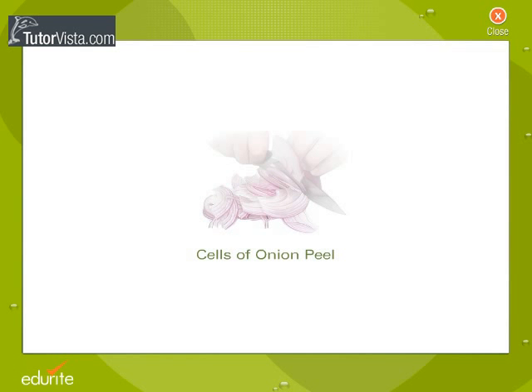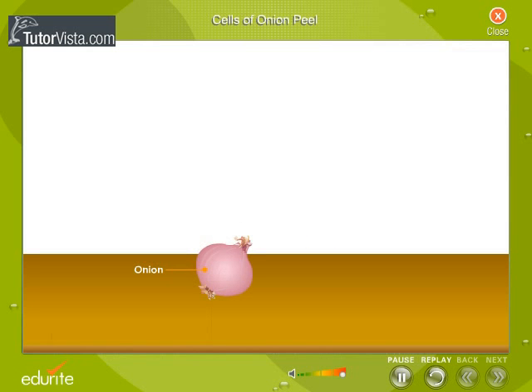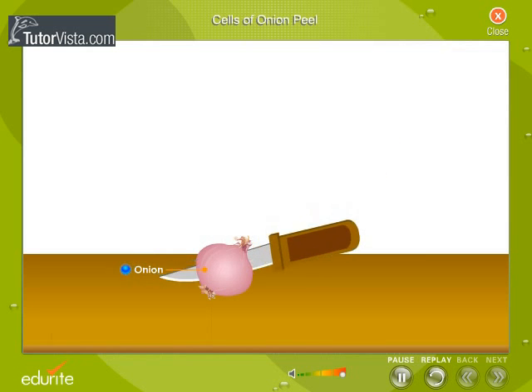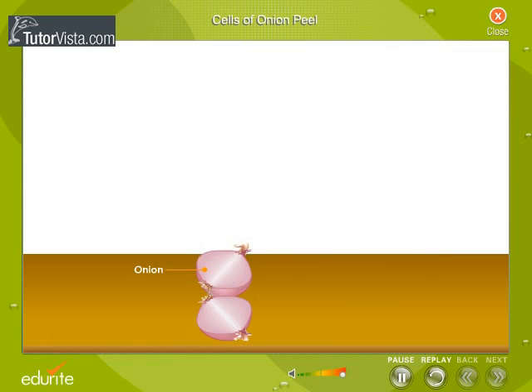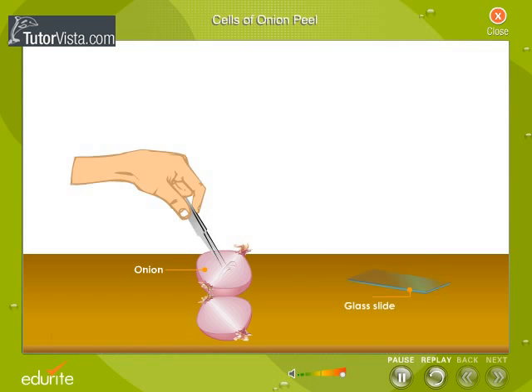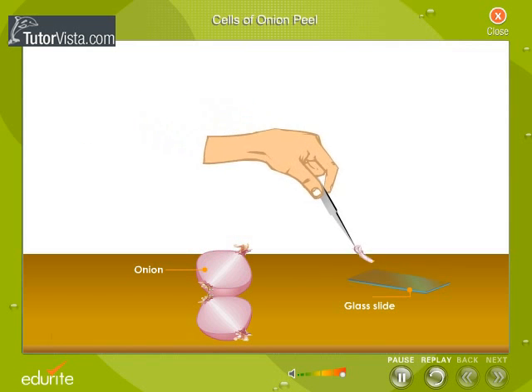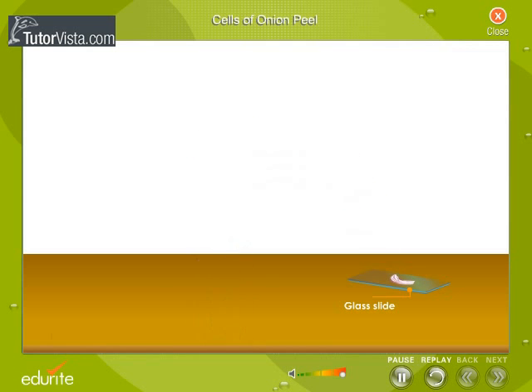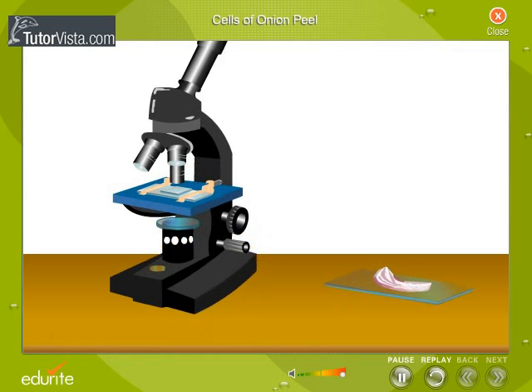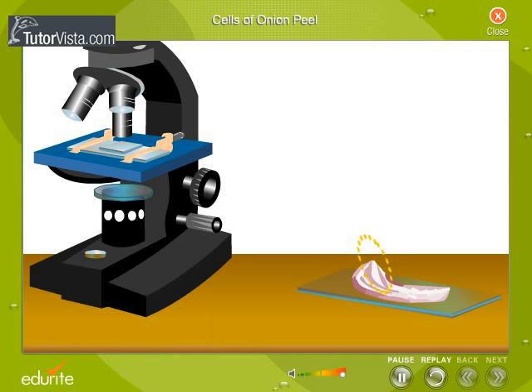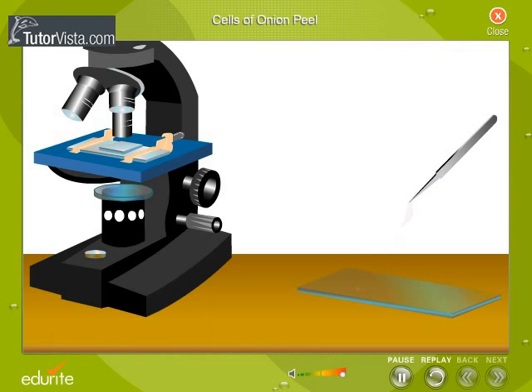Cells of Onion Peel. Take an onion and cut it into two halves. Take out the fleshy layer from the cut onion. You will see a thin papery layer on the concave side. Using a pair of forceps, tear off the thin peel and take a small piece of this peel on a glass slide.